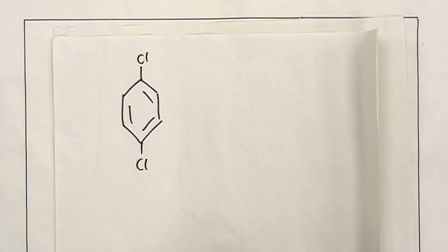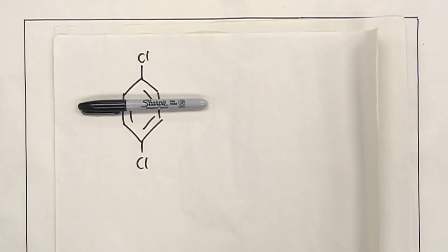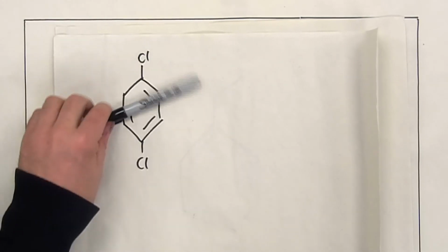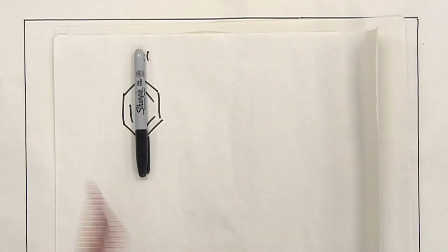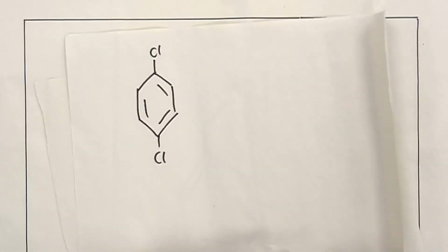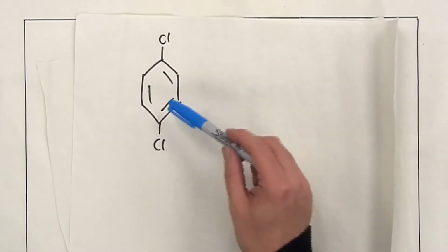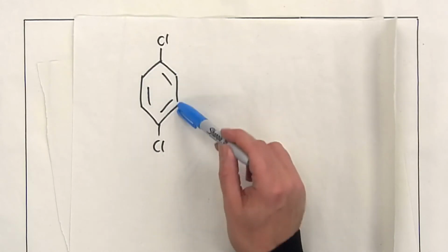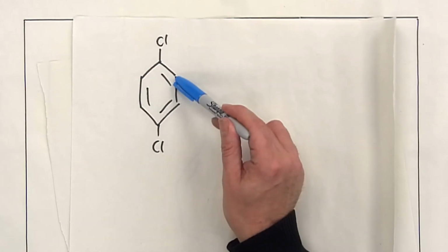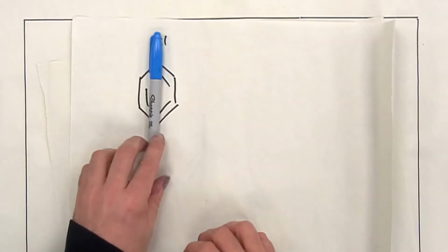And by symmetrical, I mean you can see that there's a plane of symmetry there. So one half's the same as the other half, and there's also a plane of symmetry here, so that half is the same as that half. And that helps us identify how many different chemical environments there are. So if we think about it, let me just change colour pen, we can see that, for example, this one is the same as that one, and it's also the same as that one, and that's to do with this plane of symmetry.